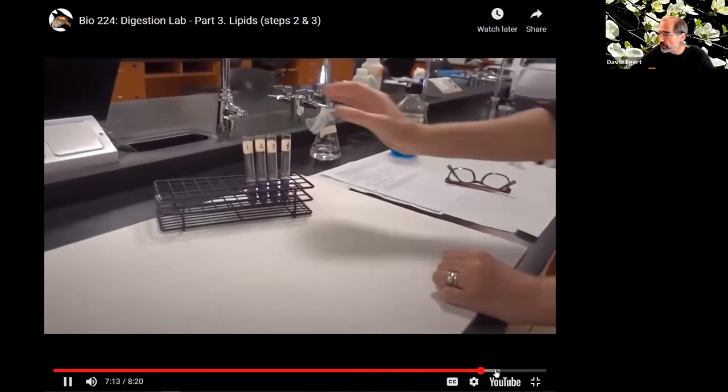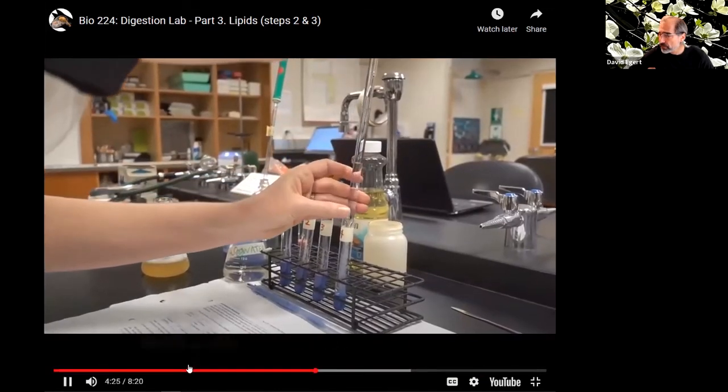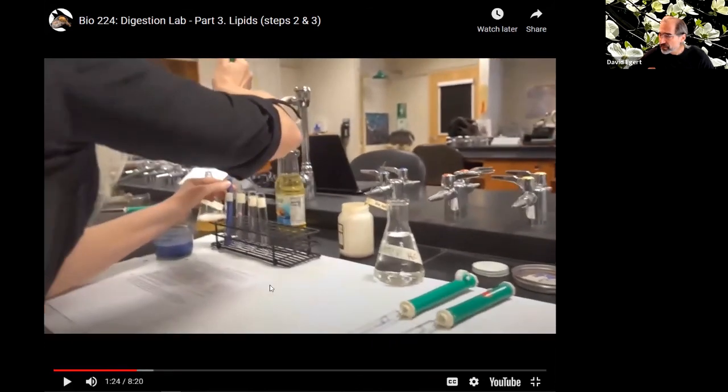So basically, it looks blue if it's neutral, if it's just cream. If it is breaking down, it will start turning red, because red is acid, and a triglyceride becomes fatty acids if you break those little bonds that are holding the fatty acids onto that glycerol backbone.